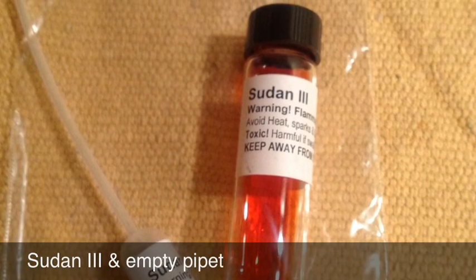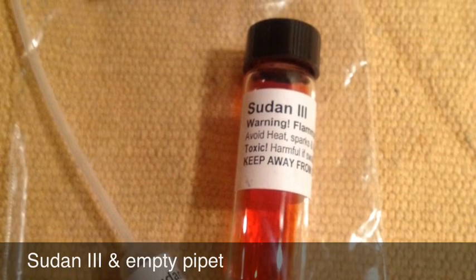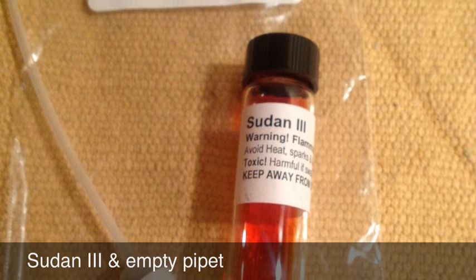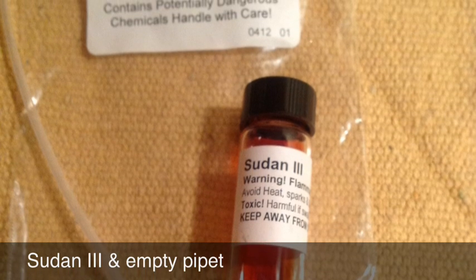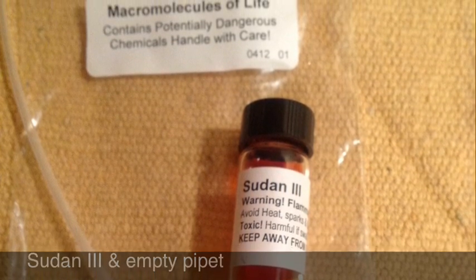The glass vial containing Sudan-3 is inside the Macromolecules of Life bag. You'll also find the empty pipette marked for Sudan-3. Be careful with this one — it's most likely to stain your clothes.